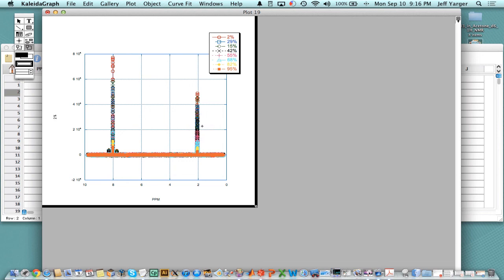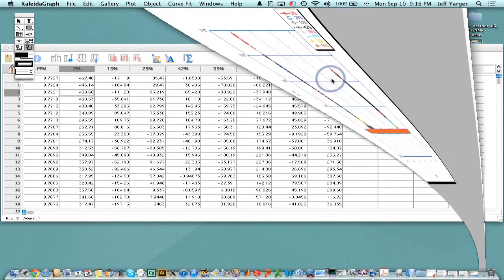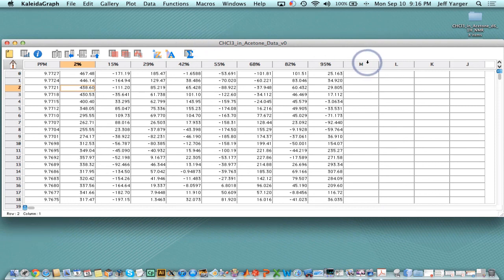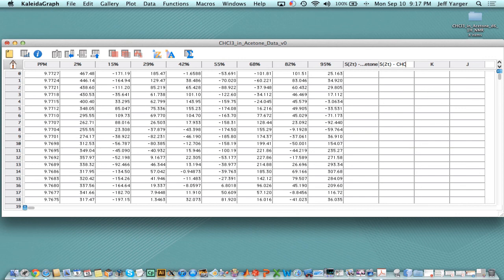I want to use the acetone peak at 2 ppm to calibrate my gradient, and then use the signal intensities to determine the diffusion coefficient. So what do I need to do? The first thing is to know the signal at 2τ for acetone, and then the signal at 2τ for chloroform — might as well do them both at the same time. Then, because of the equation, I want to linearize this plot, so I want to take the natural log of those signals.